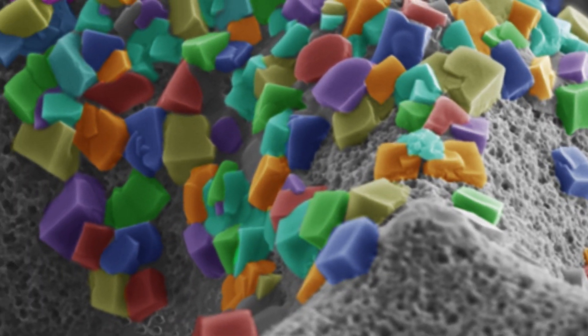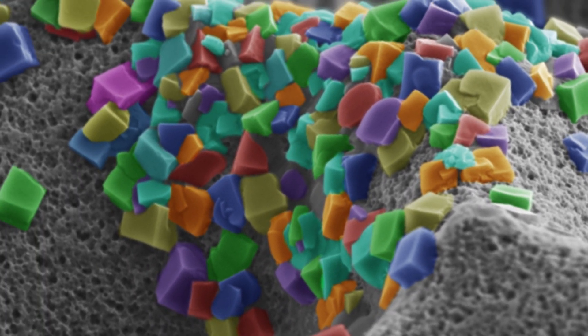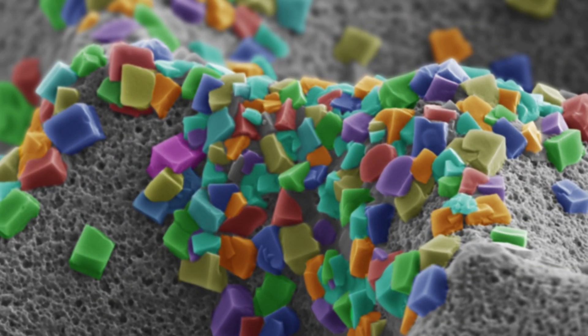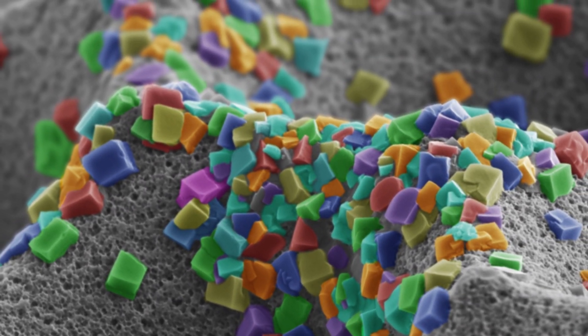I named this image the Little Rock Candy Mountains. It shows the surface of a radiolarian, which is a microorganism that lives in the oceans and the surface waters.